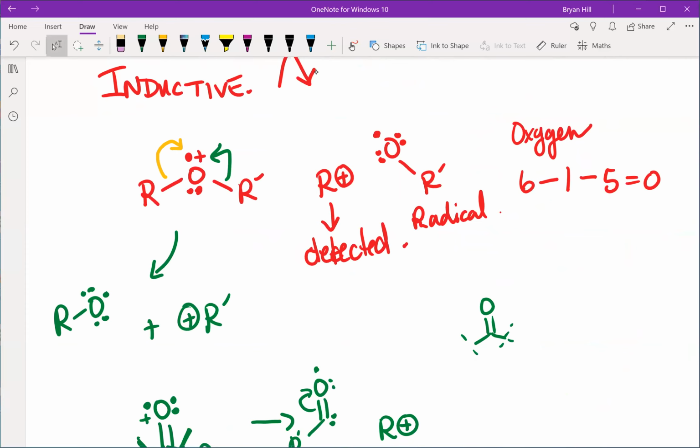Okay, so on Thursday we'll talk a bit more. What we did with the infrared is we basically did a survey of all the functional groups and what are some of the things to look for. We'll do something similar for mass spec. It can be a little tedious at times, but hopefully with a little bit of practice, with mass spec, there's a few things that we can look for which will give us a whole bunch of information right from the start.